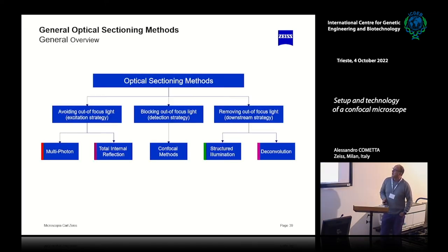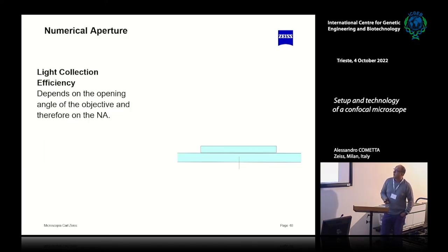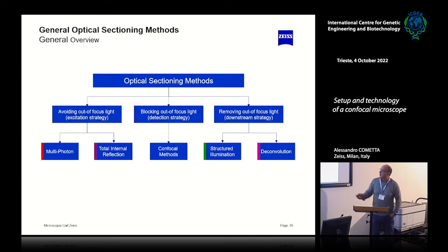At the end, we are here again, sorry. And we are here in the confocal methods. But keep in mind that optical sectioning can be done even with deconvolution, so just pure software, and also with multiphoton.